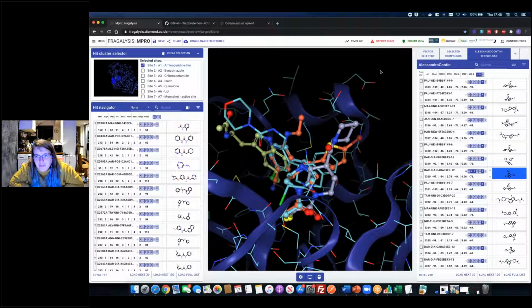In your display, can you show B factors? Not yet, no. Okay. Fragalysis is still very much under active development. So, you know, it's a proof of concept and an idea for what we can do, but we're very, very much open to working with other people and getting their ideas. So, you know, the good thing about this for me is that it's getting the concept out there for other people. And if you guys want to feed back to us, please do, because things that you think of as chemists, we won't necessarily think of as crystallographers and computational chemists as well sometimes.